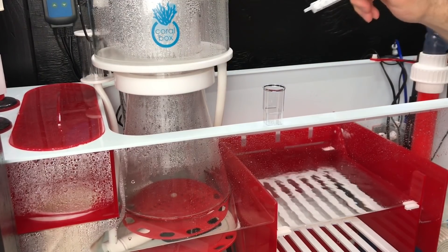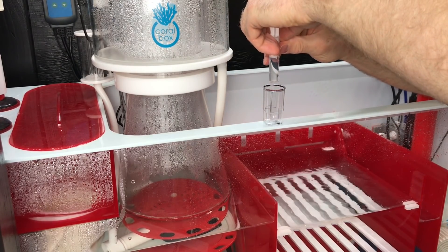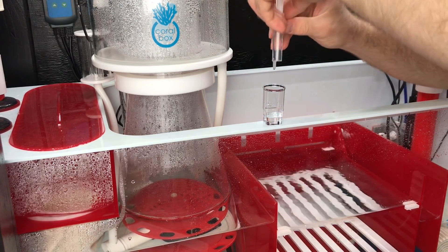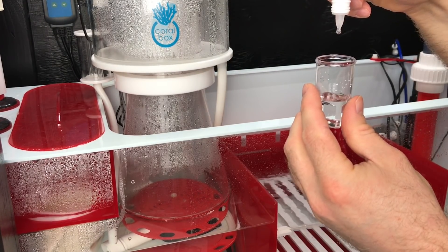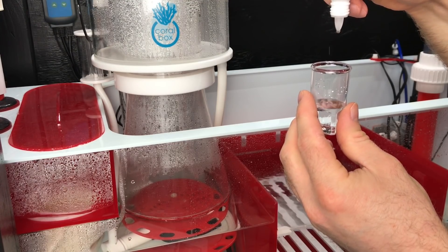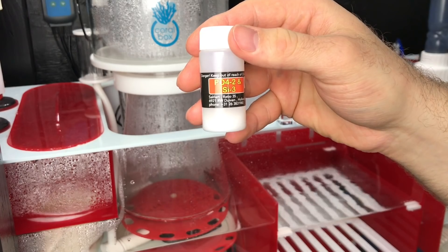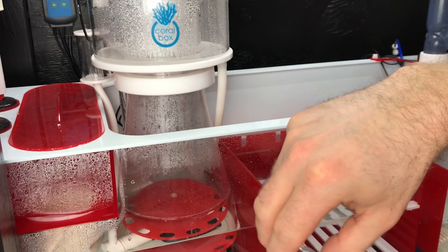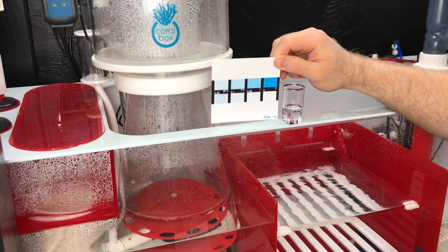Now checking phosphates. Fill the vial with 10 milliliters of water, add 4 drops of PO4-1, stir for 10 seconds. Then add one scoop of PO4-2 and SI-3, mix for 30 seconds. Phosphates are at zero - the solution is completely 100% clear.